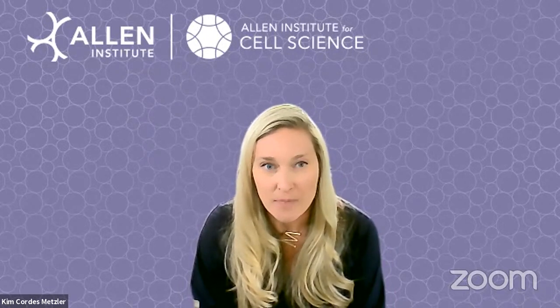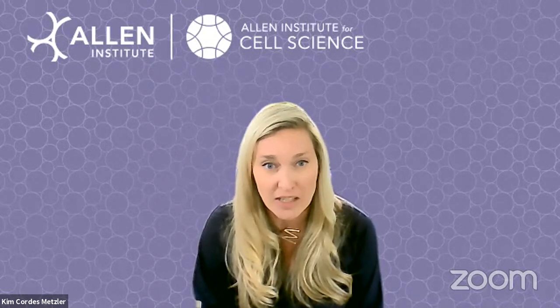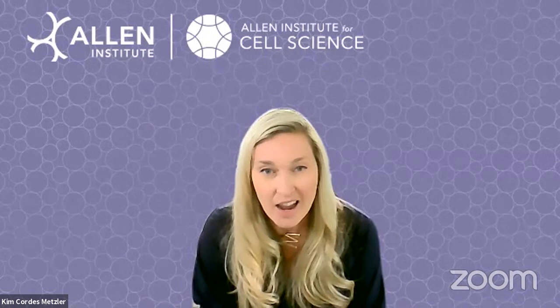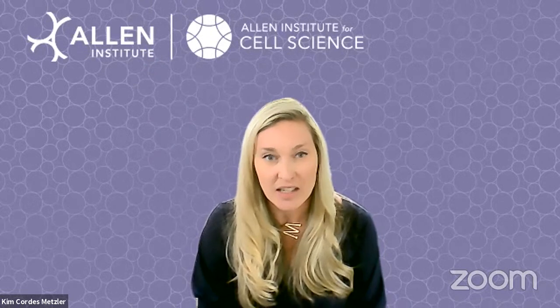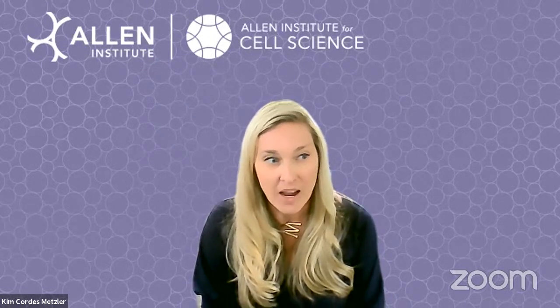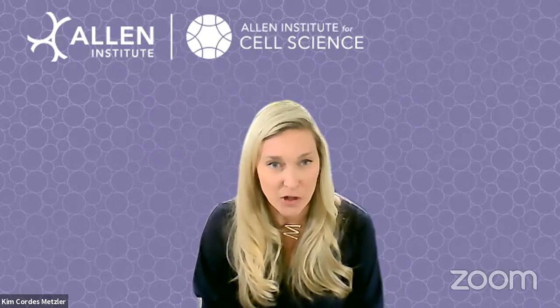And the other part we're doing is with the 4D Nucleome project. We are also thinking about how to integrate single cell imaging information with single cell genomics, for example, and other information. Although we have come up with some strategies to tackle that, it's still an exciting field to jump into, because I think a lot of people are starting to think about that.